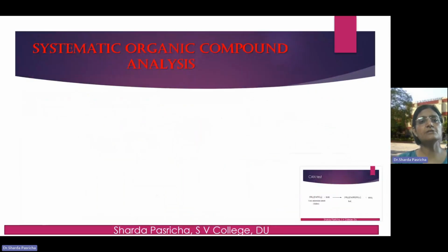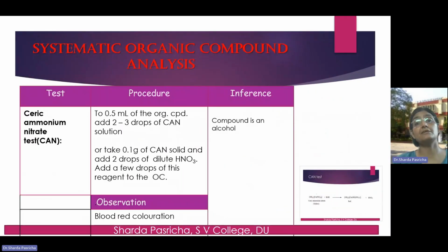The second test, once you get the sodium test positive, please understand, only if you get the group test positive should you go on to do the special test. If the group test is not positive, you go on to the next function. That is the approach we have to follow throughout the systematic analysis of organic compounds.